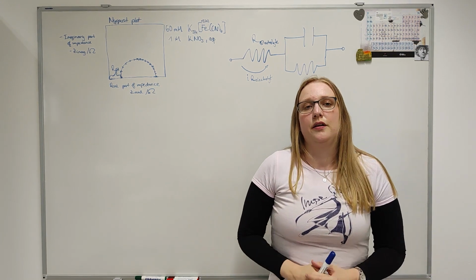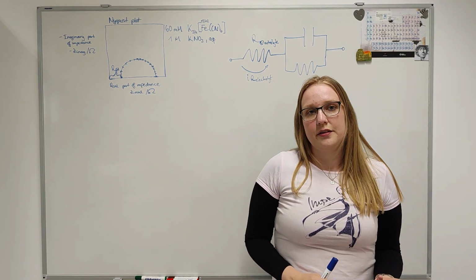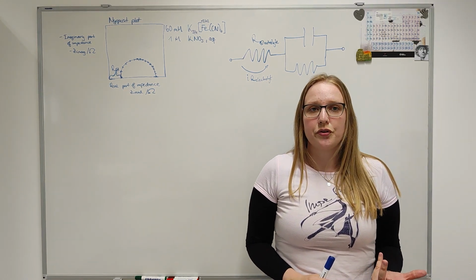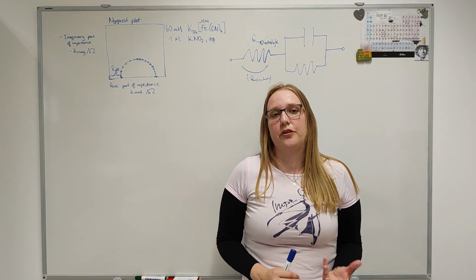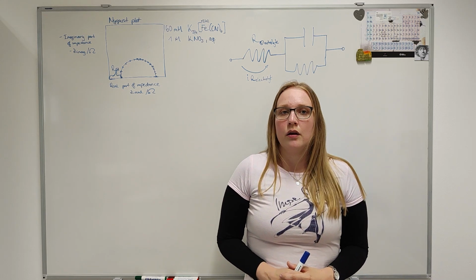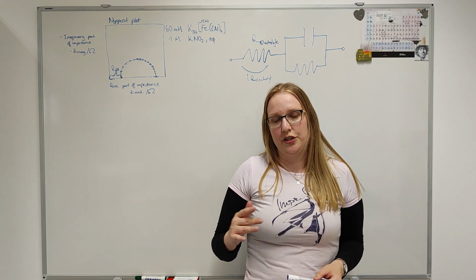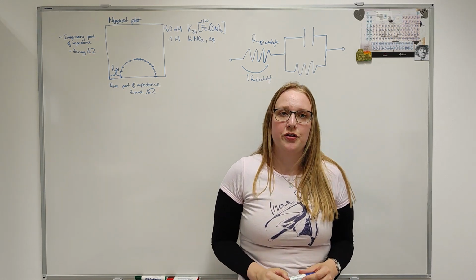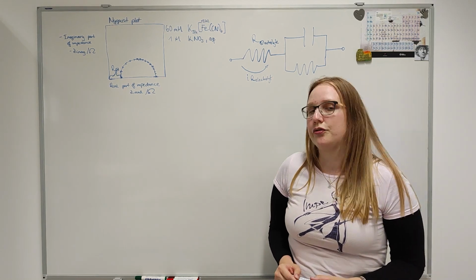Another case we often encounter in electrocatalysis. Here electrocatalysts are often researched regarding their electron charge transfer kinetics for the electrocatalytic process, and this is done by linear sweep voltammetry. For this, the potential is swept and the current is measured, but here also the current always has to flow through the electrolyte.